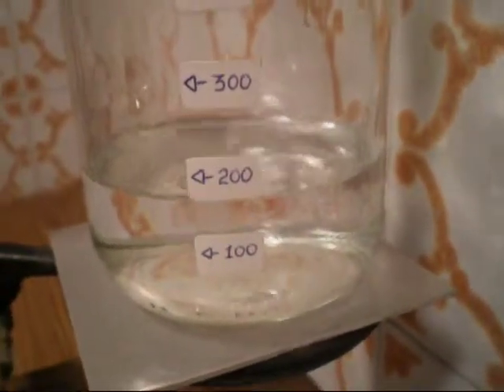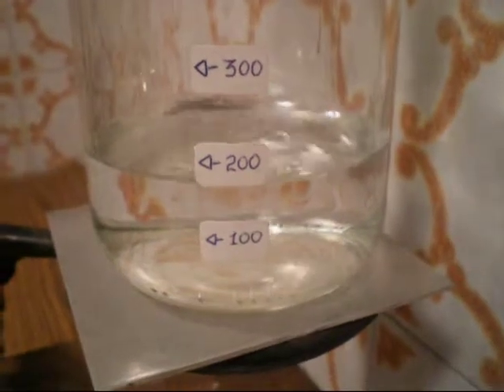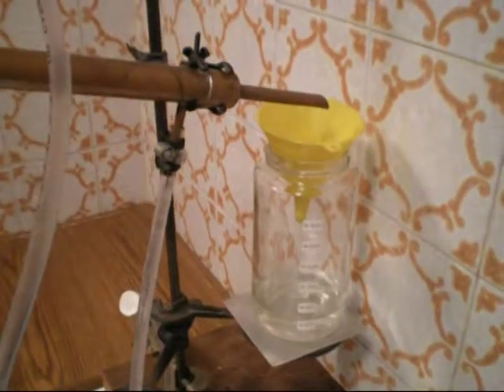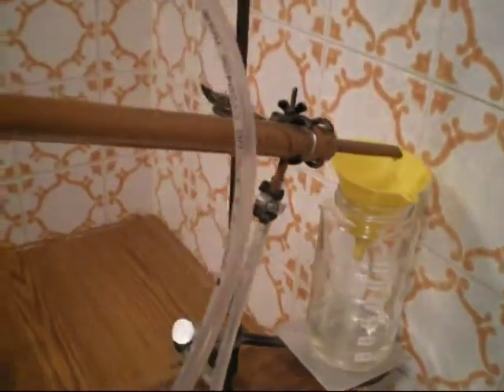Here we see the liquid coming out of the condenser at the end of the process. This condenser is water cooled and can dissipate up to 1000 watts without ventilation.